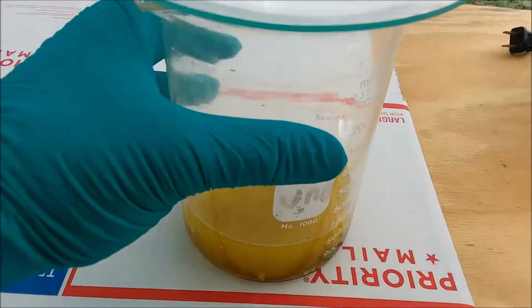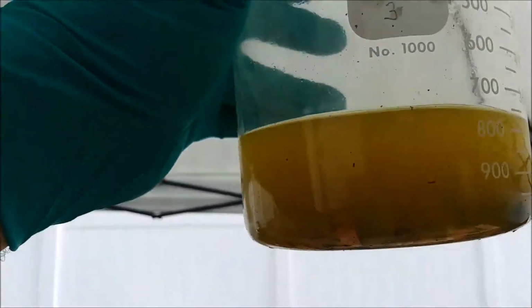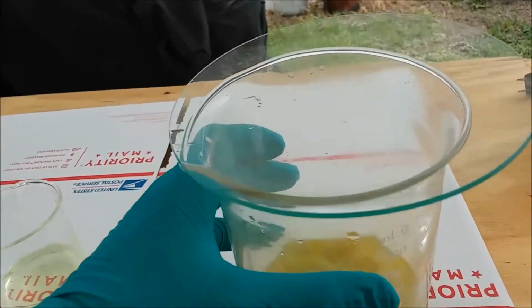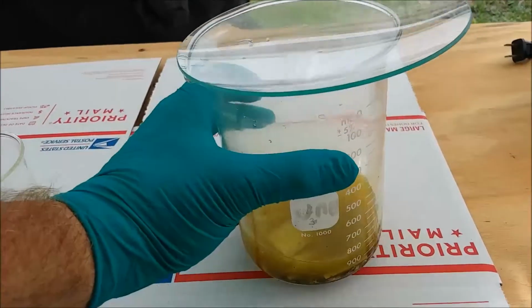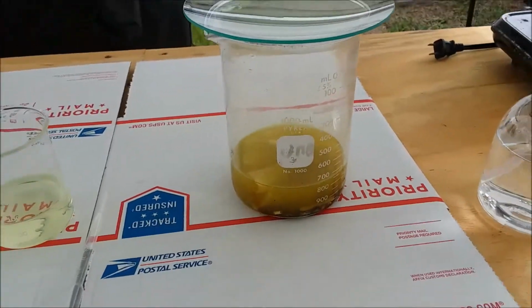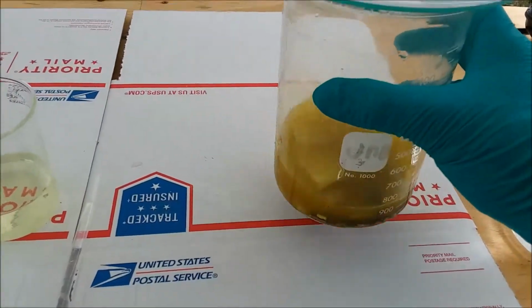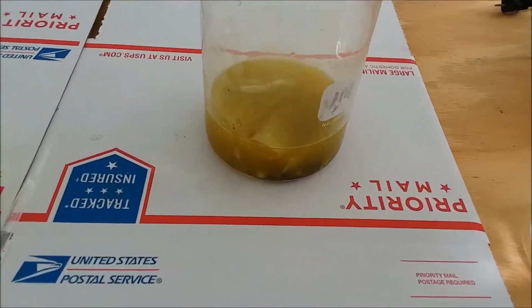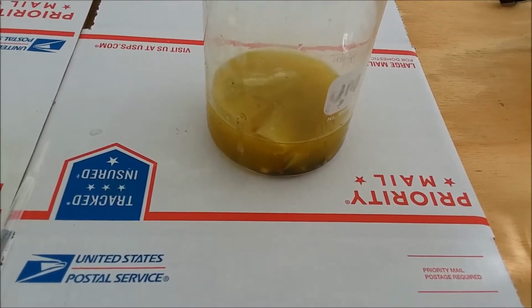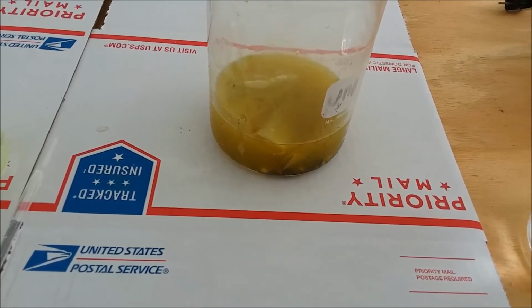Okay, it's been another 15 or 20 minutes since the last few shots of bleach I put in it, and the gold is definitely dissolving. I can see now that probably half to 2/3 of it has disappeared into solution, so that's good. I'm just going to give it a little more agitation here and let it sit a while longer. I can smell the chlorine gas coming out from under the watch glass, so I'm not sure it needs any more right now. I think it just needs time. So I'm going to let it sit a while longer while I work on some other projects and come back and check on it. If nothing much has happened, I'll add a little more bleach.